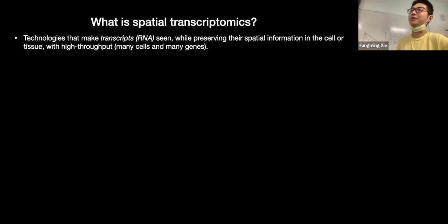It's letting you see the actual RNA? Yes. And then where it was. Exactly. So we'll talk about it in a second. What do we mean by making it seen? Obviously, it's not rigorous scientific language, but it's a good way.